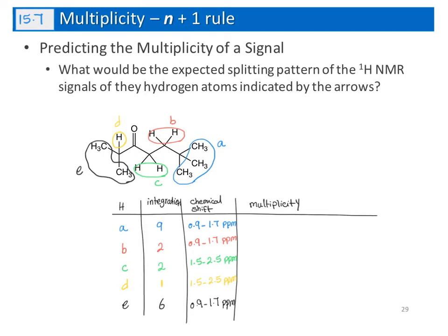Now let's define multiplicity here. So again, we need to define multiplicity for one of these hydrogens, and that can be true for the rest as well. So this hydrogen is connected to the carbon. Then we need to look at the neighboring carbon, which is this carbon. So there is no proton connected to this carbon. Therefore, the multiplicity would be 0 plus 1 gives us 1. So it should be a singlet. And we show that with a small s as well.